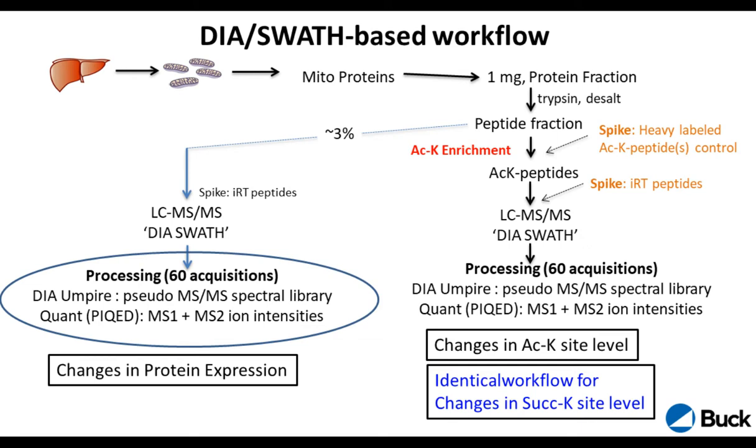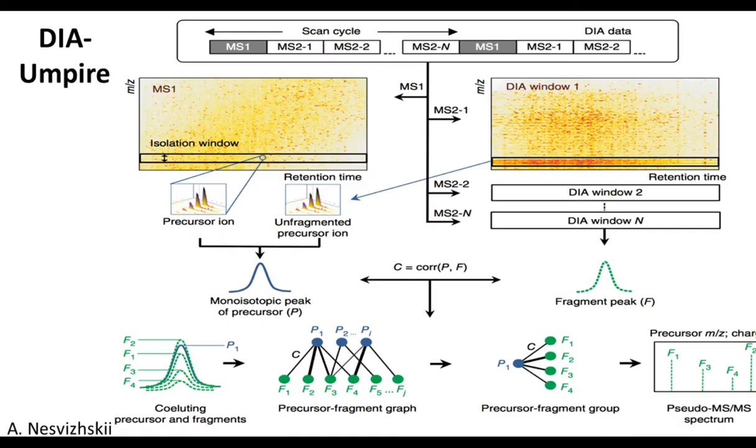Okay, we switch to the next slide. Here on the next slide, you can see our workflow a little bit, and so we would digest the samples, get a mitochondrial extract, and then digest the mitochondria, and then use the antibodies to enrich here. And we would start with acetyl, then do succinyl. So basically we would use 2 separate samples for that.